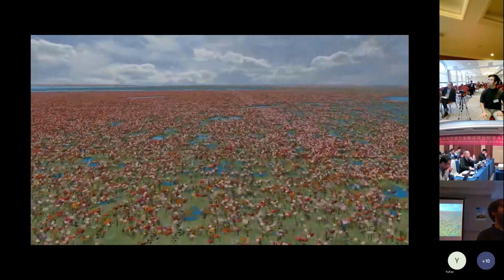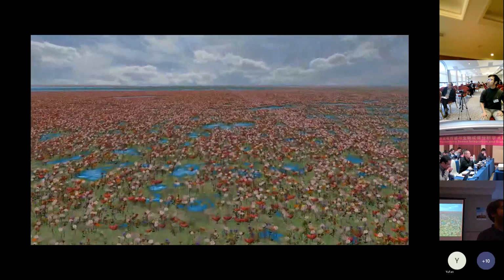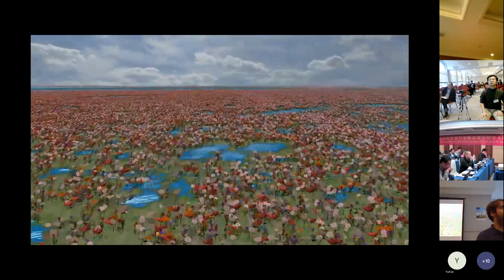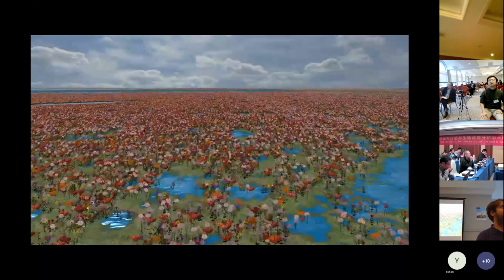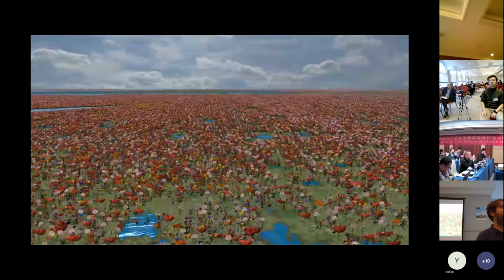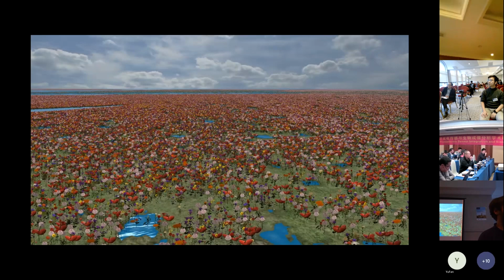I have a question about how you arrange the tiles. It's clear to me that when you zoom in and move around, you load and enable tiles, right? But I'm less clear how you can have the overall atlas of the brain, because you have just patches as input. How can you zoom out from the images, because you have small patches, right?